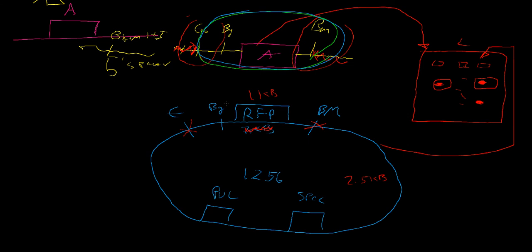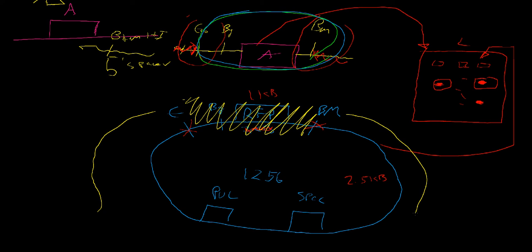And for our plasmid, we're going to be getting rid of this. So we're going to be just left with everything else, everything outside. It's going to be hard to draw a circle around it, but everything outside of that scratched out area. And then we have an Eco site right here, which is compatible with that Eco site, and a BAM site right here, which is compatible with that BAM site, so that when we put this part, this basic part, in with this vector backbone, we can ligate them.